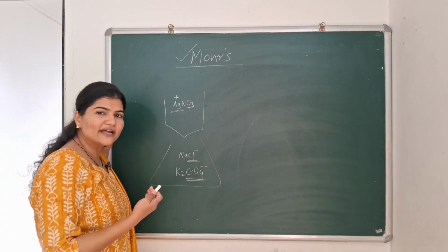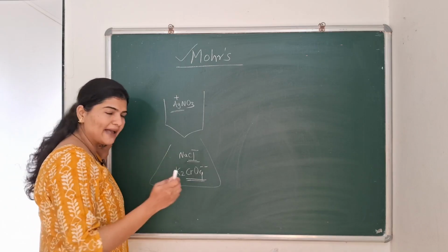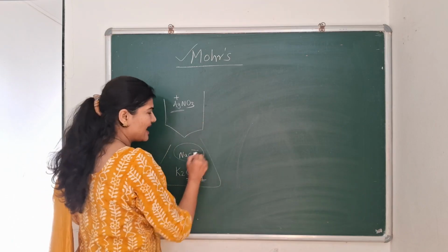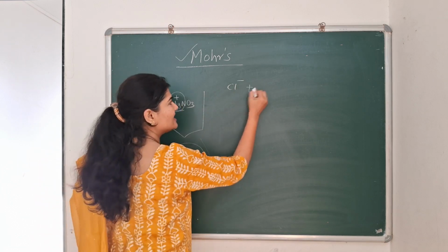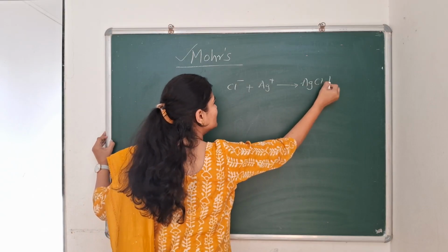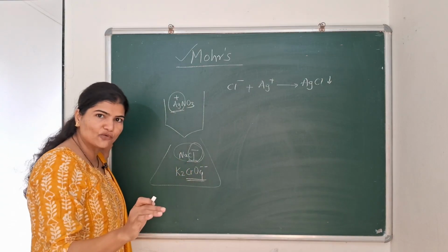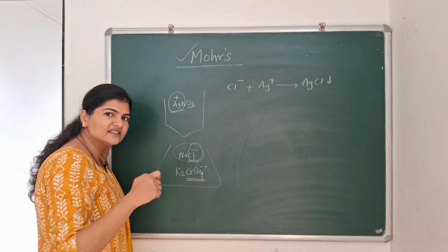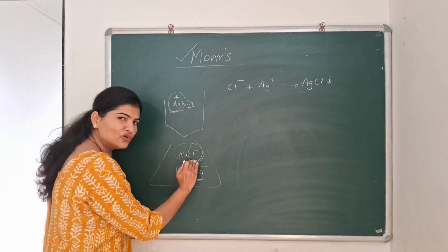Now let's look at the reactions going on. So what will happen is NaCl is our analyte. So this NaCl means the analyte ion, chloride ion, will react with the precipitating ion to form AgCl PPT, right? Now once all the chloride ions are finished from the conical flask, when the excess drop of silver nitrate will come down, now there are no more chloride ions.